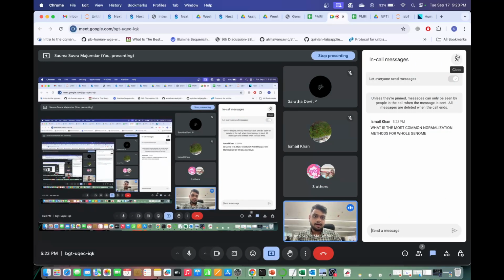Now, hi Ismail. You cannot say one is the most common normalization method. As I was saying, depending on what question you are trying to ask, you use the normalization method. So if your expression is very high across the board, for example, TPM and FPKM and these types of things are mostly used. As you see, we normalize using per million. There's a reason why we are doing per million, because your transcripts are very high in number. So normalizing by per million gives you a better scaling factor for the whole data set.